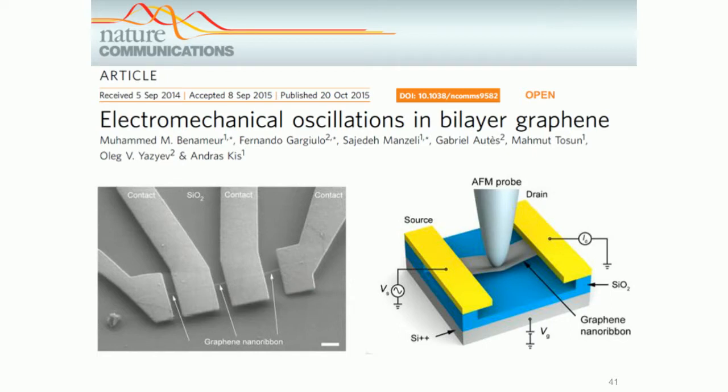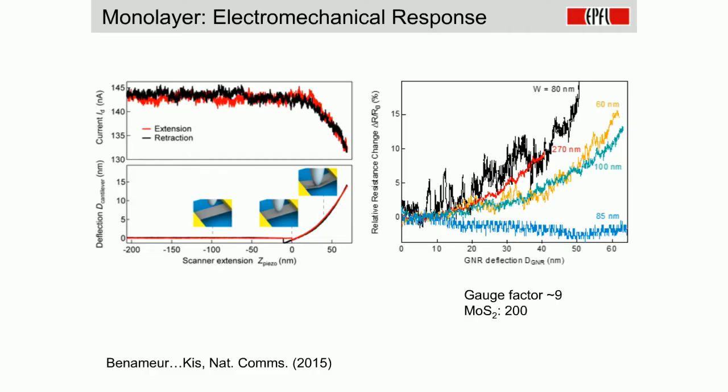We apply voltage, we measure the current. The notable difference is that in this case we used very small AC voltages, because we were looking at very small hypothetical band gaps, and then we used an external lock-in to lock into the oscillation frequency of the applied voltage signal, and then again the lock-in output was routed to one of the inputs of the controller. It's a bit more complicated setup, but again pretty much the same thing. So we were able to deform and measure the conductivity at the same time.